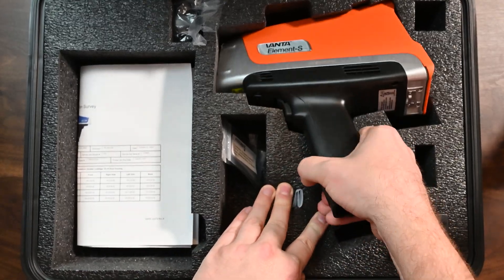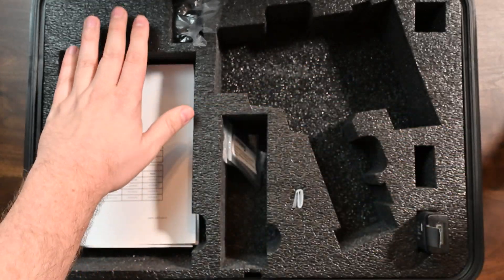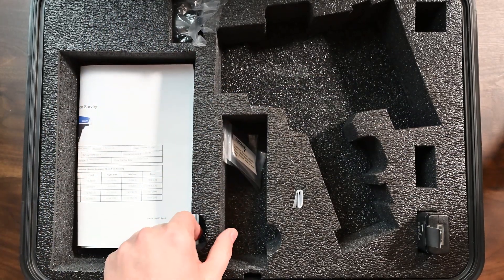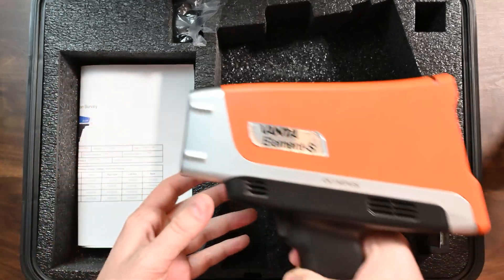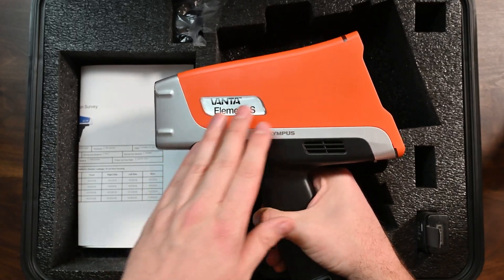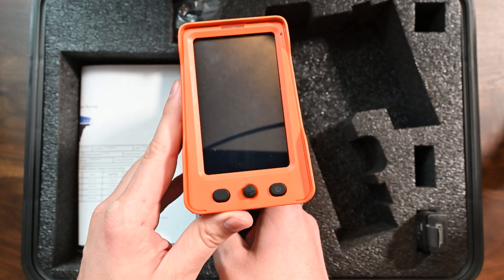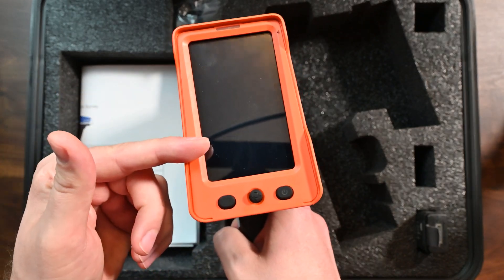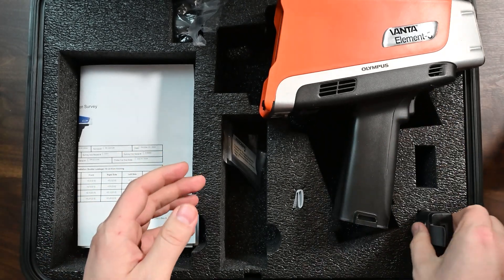Let's take a look at the Vanta Element S. You'll see it was kind of snug in the case there. This foam here is that nice harder foam — actually it's pretty nice. I think it's like an upgrade versus the softer foam that tends to get dirty. The analyzer looks good. I love the orange color on this analyzer. The back of the analyzer looks really cool. The screen's nice, big, and long.